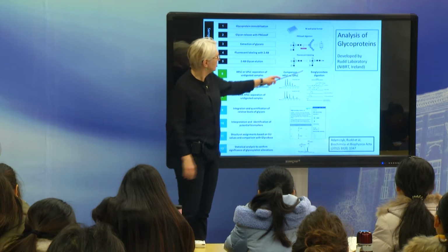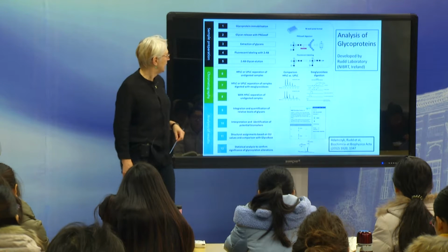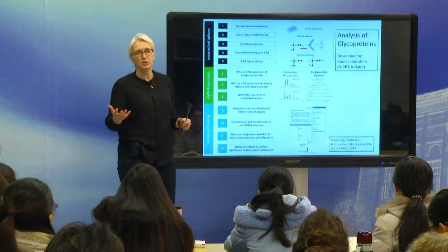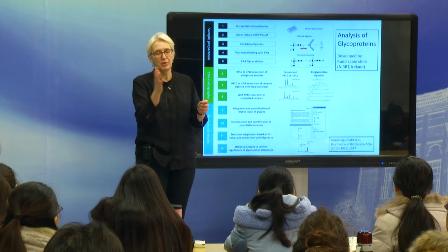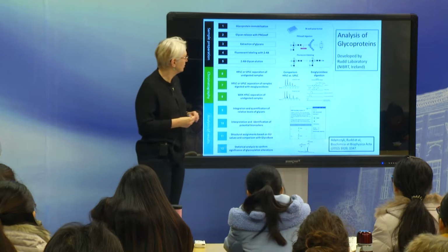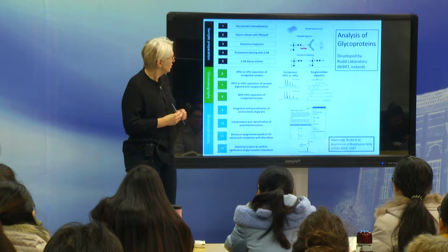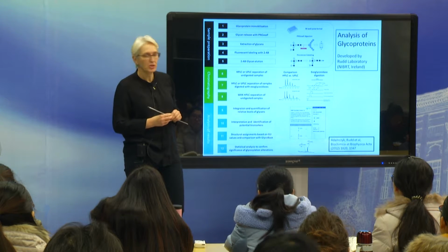So now you've got your set of fluorescently labeled probes. You need to analyze them. And as I said before, mass spectrometry only helps you in a limited amount, in the sense that it tells you about the branching and it tells you the molecular weight of each building block. It doesn't give you sort of the identity. So what they use is they actually use LC methods.